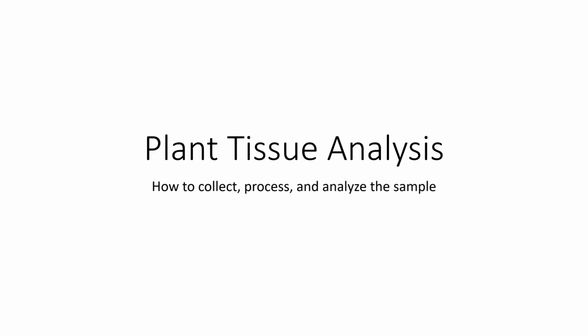Plant tissue analysis: how to collect, process, and analyze the sample. We're going to talk about a lot of different things in this. All of these are very important, as collection of the proper specimen gives you a good result. Collection of a bad specimen gives you a bad result.